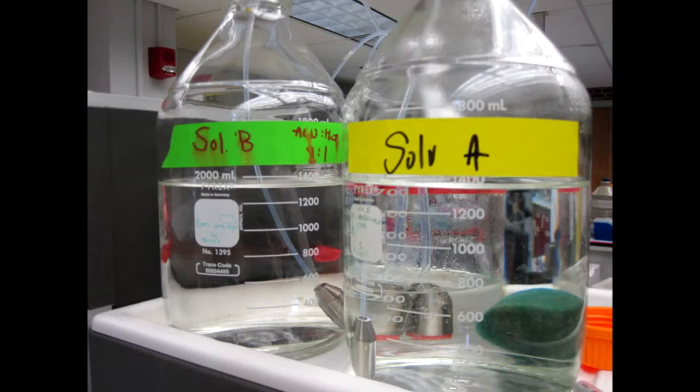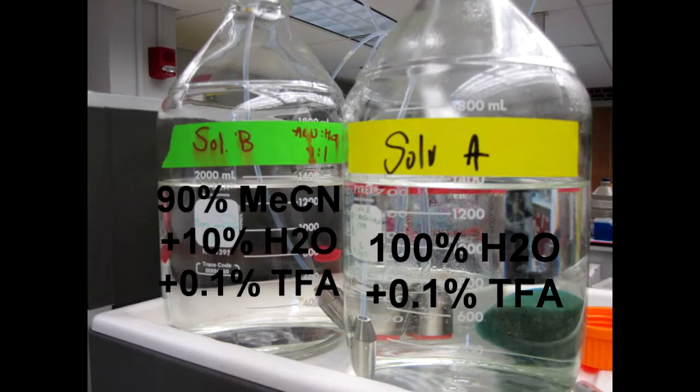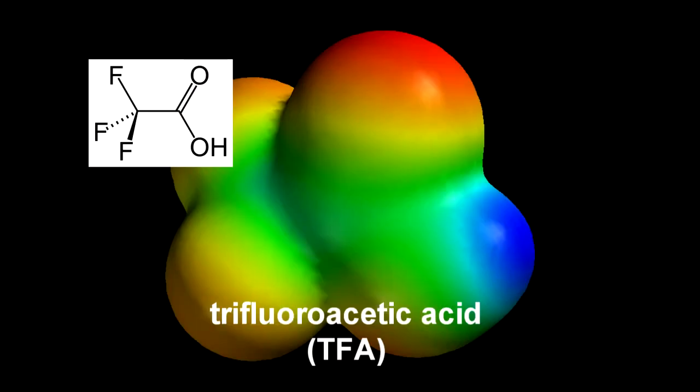Our lab labels these solvents as solvent A and solvent B. A is 100% water and is used to equilibrate the column. Solvent B is added at an increasing rate, which can be modified specifically for each sample. In most cases, we use a 90% to 10% ratio of acetonitrile to water for solvent B. 0.1% of TFA is added to both solvent A and B before the run occurs.